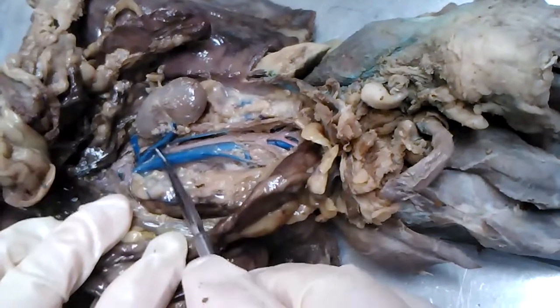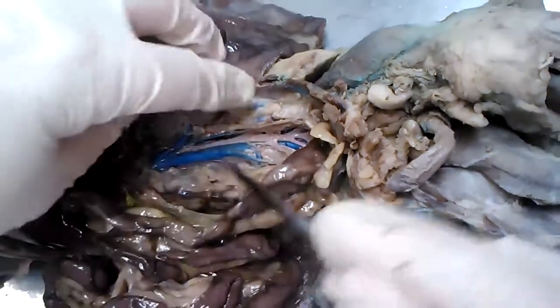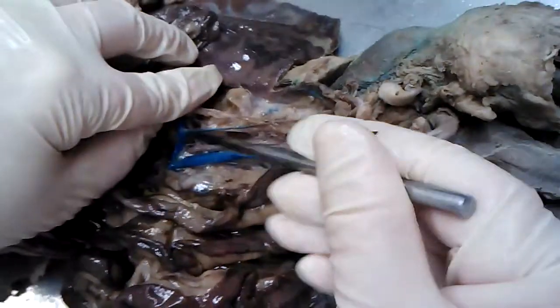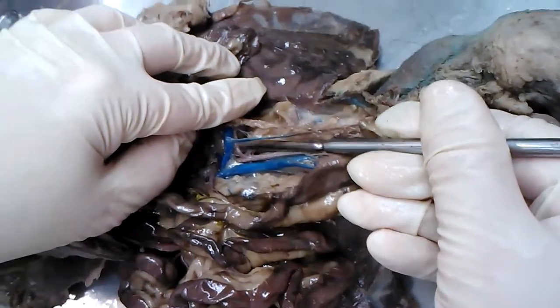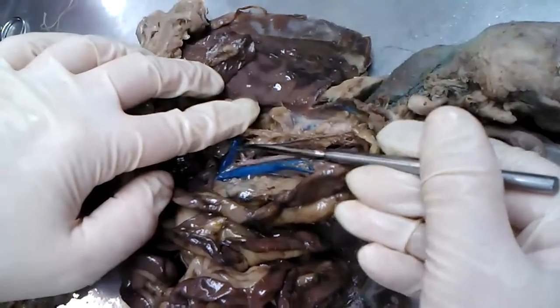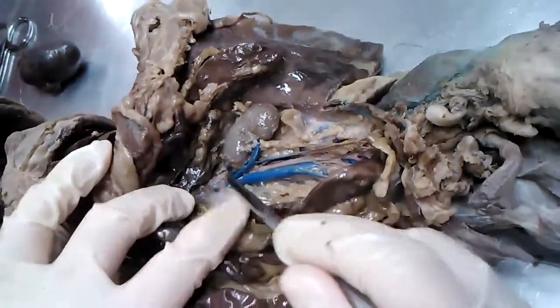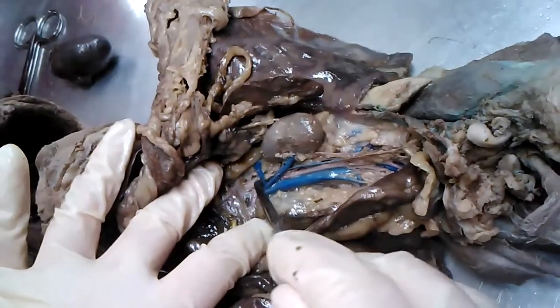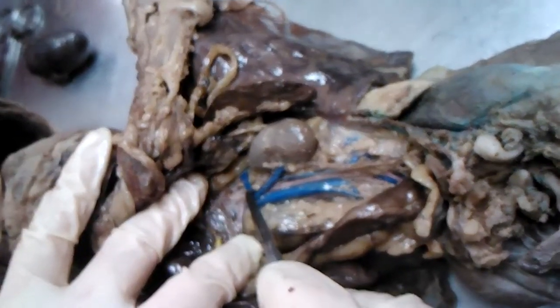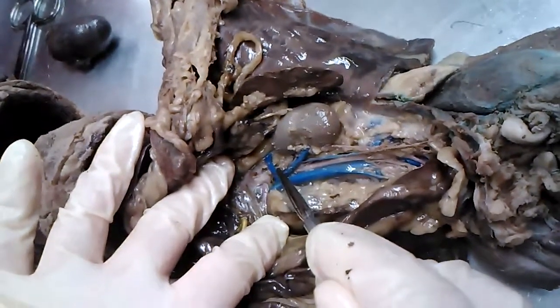Coming up here with the kidney, this vein coming from our left kidney, this is the left renal vein. And right behind it, kind of right in here, you see a nice left renal artery right in there. Okay, so left renal artery and a left renal vein coming through there. Just above the kidney, by the way, this little tiny bean-shaped structure right here, actually, this little white thing, that's the adrenal gland. So this little white thing right there is the left adrenal gland on the mink.